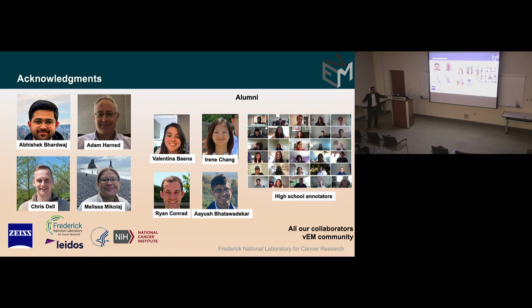So you aren't creating 61,000 classes. It's still one class of mitochondria, but it also spits out centroids of each instance in that semantic class. Okay, so it's still one class, but an infinite number of instances of that class. So it's sort of like an umbrella or nested. You can think it actually happens in parallel.